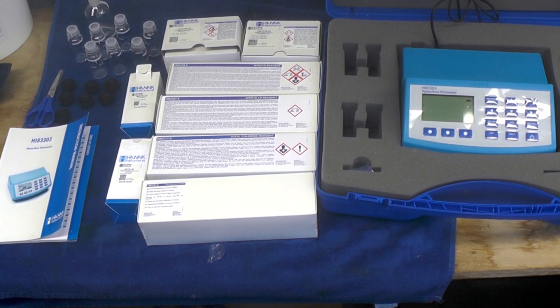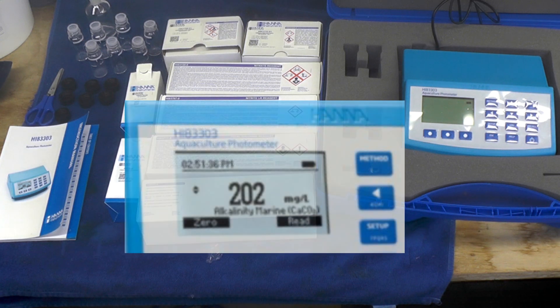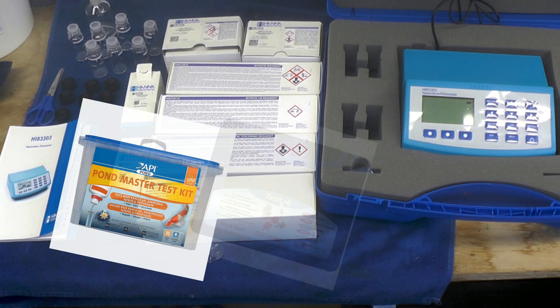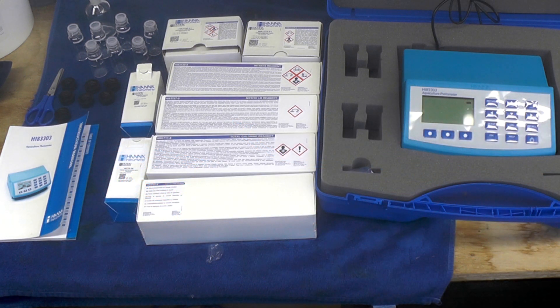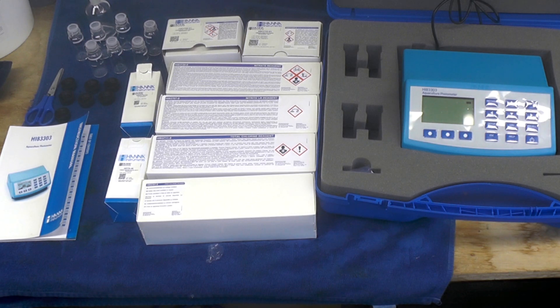Sorry if you can hear any whirring noise in the background — that's the two pumps running and probably an air pump as well. This is the Hannah Aquaculture Photometer HI-83303, the one I did the original test for. It's a very expensive piece of kit — it's not a necessity. You can comfortably get by with the Columbus or the NT Lab test kits, or the Hannah checkers which are about 60 to 70 pounds.